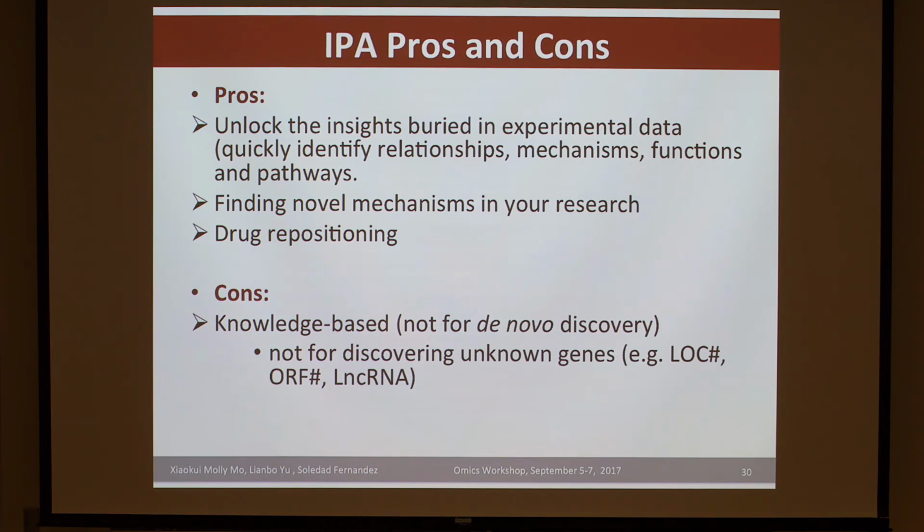Another usage of the IPA is drug repositioning. You can use the overlay feature in the IPA to see which drugs can target the molecules involved in your study.